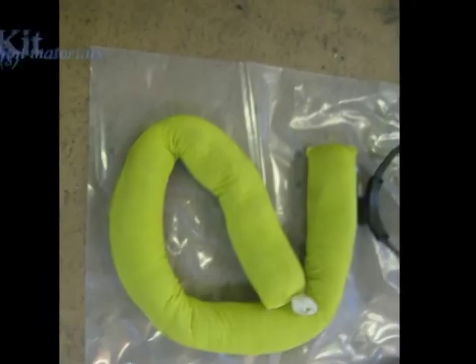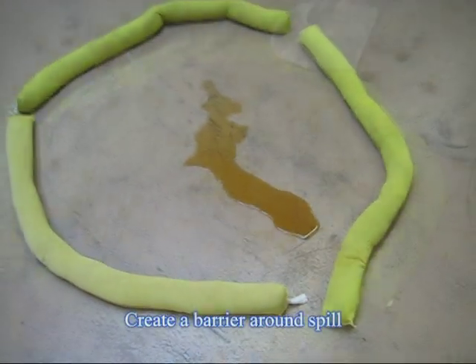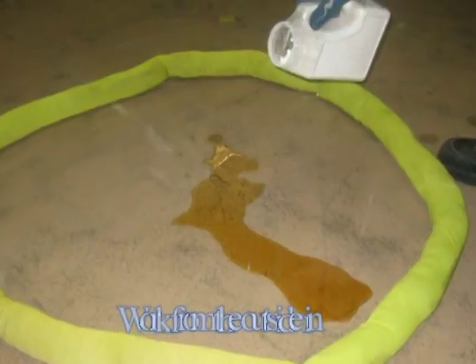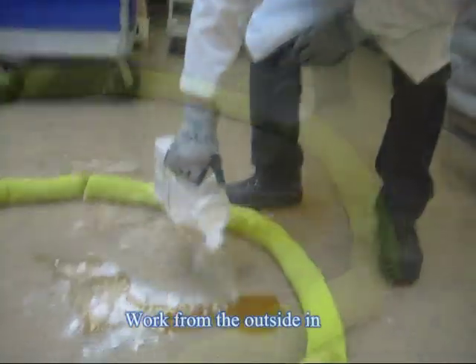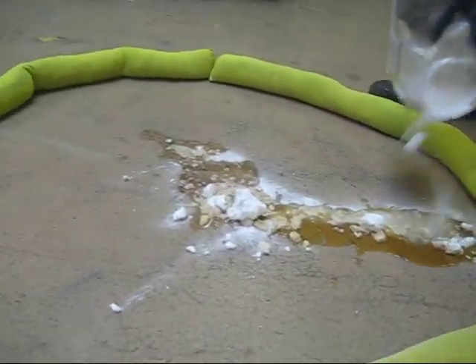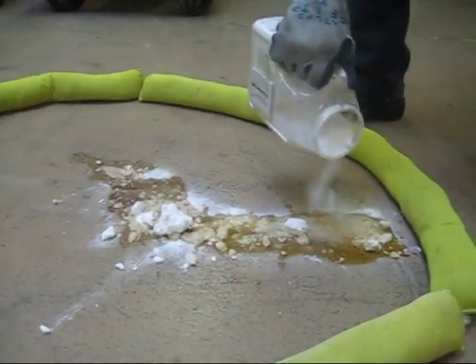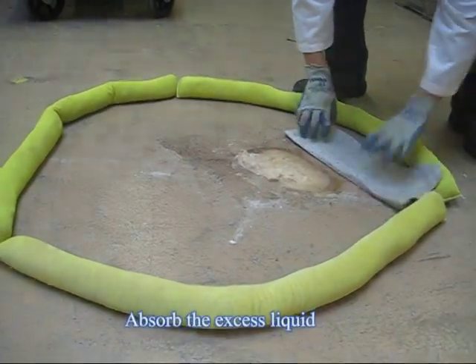Confine the spill to prevent spreading using spill socks or other materials that can create a barrier. When cleaning up, make sure to work from the outside in — that is, work around the edge absorbing and neutralizing toward the center of the spill. Neutralize with a weak base if it's an acid, or a weak acid if it's a base. Let it stand for a few minutes to allow for the chemical reaction to take place.